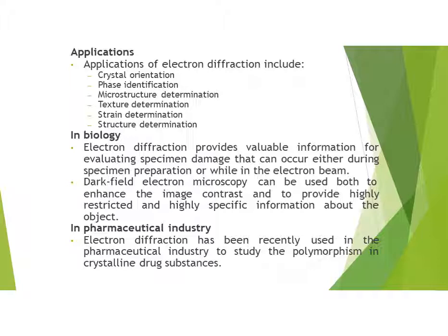Dark field electron microscopy can be used to enhance the image contrast and provide highly restricted and highly specific information about the object. In the pharmaceutical industry, electron diffraction has recently been used to study polymorphism in crystalline drug substances.